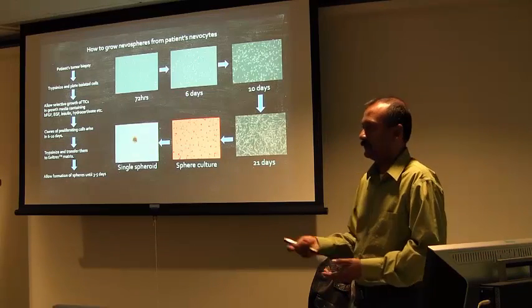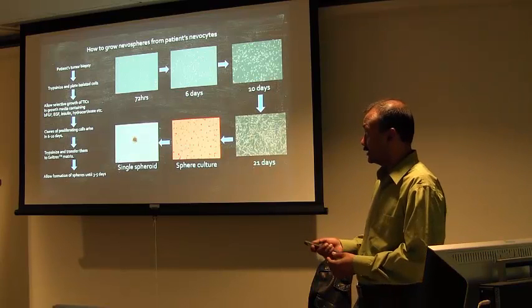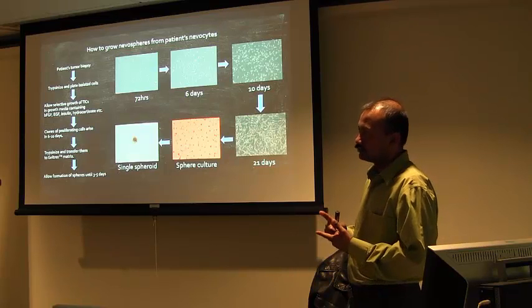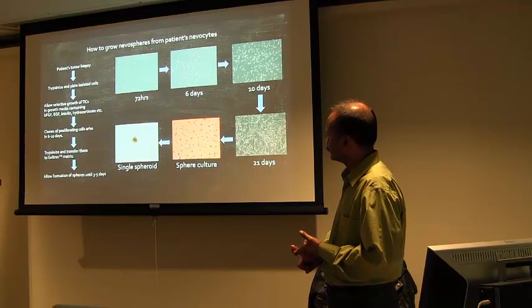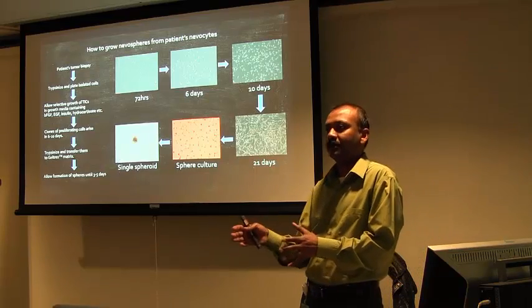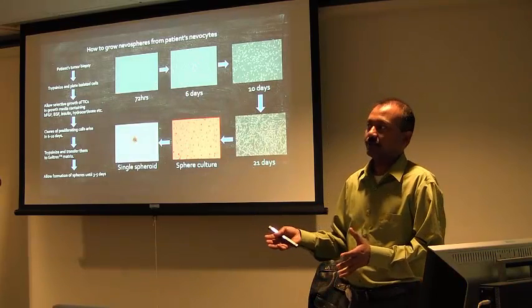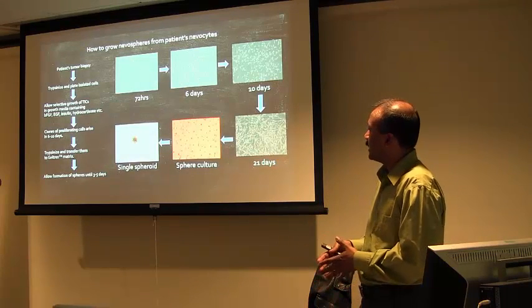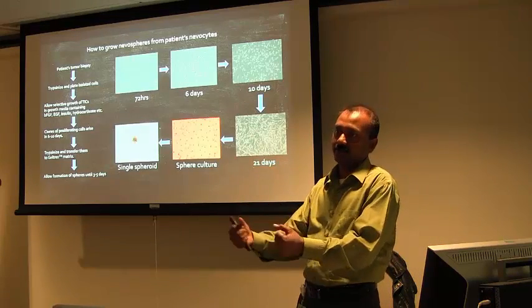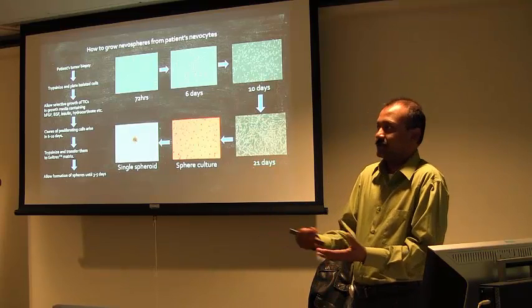We can study drug sensitivity or cell signaling or whatever we want to do with them. Immunofluorescence. One problem, not a problem, but the way we harvest cells from monolayer cultures and from spheroids is different. For cell survival assays like MTT, you can do it directly in the plate. You add the reagent, and it's colorimetric, so you wait for the change in color.